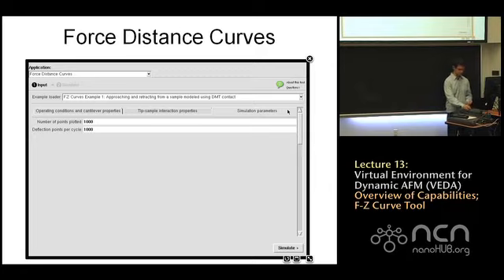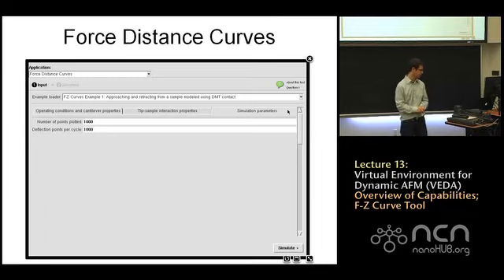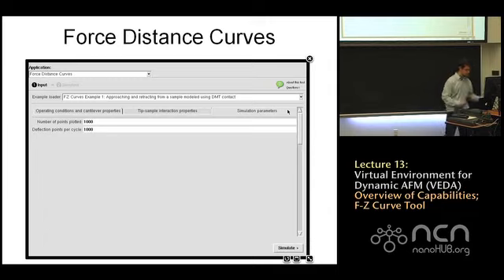So with that, select Simulate at the bottom right corner. This simulation should run, and there's a progress bar. Okay, so are we all on the same page? Looks good. Okay.